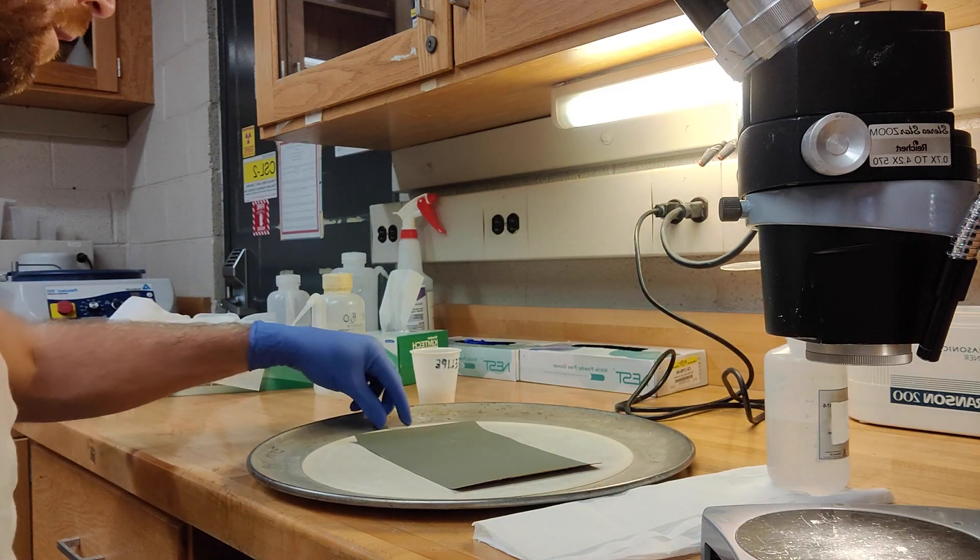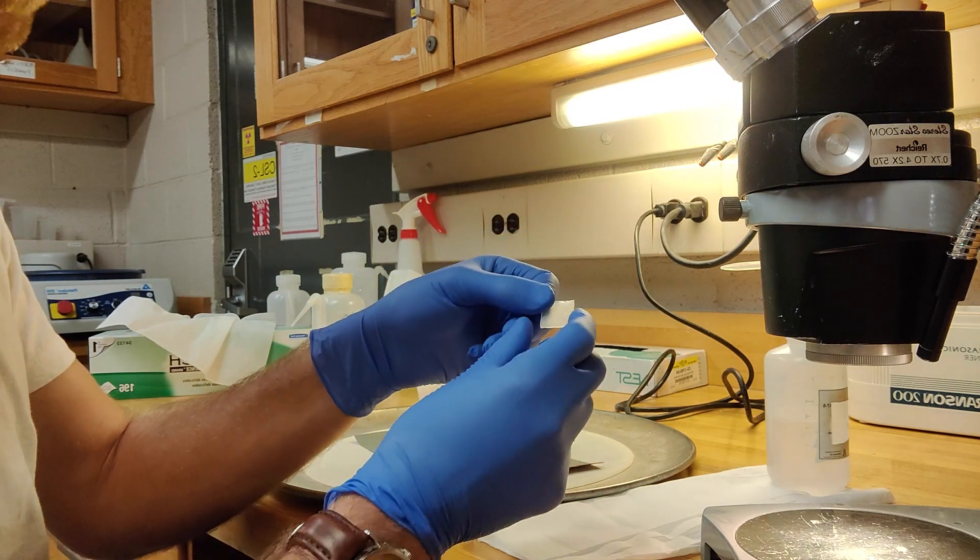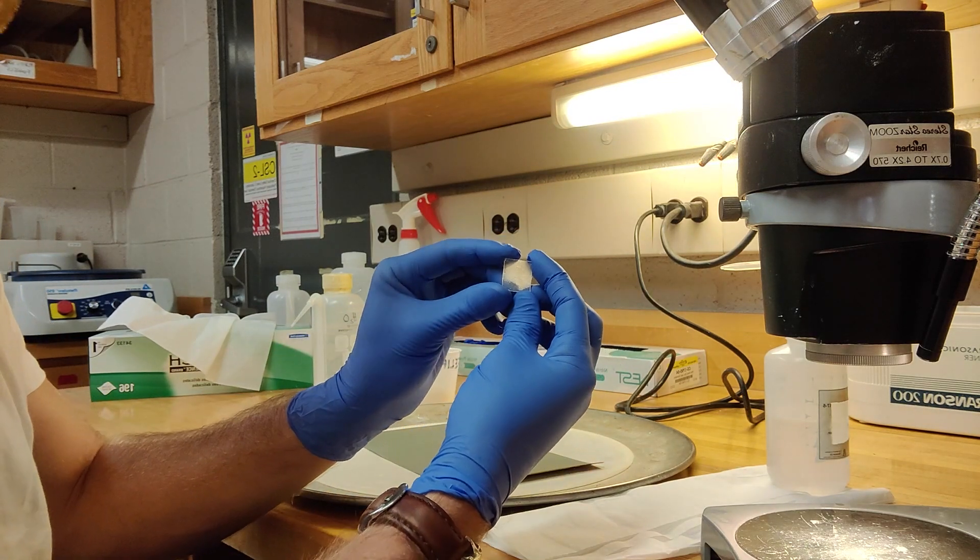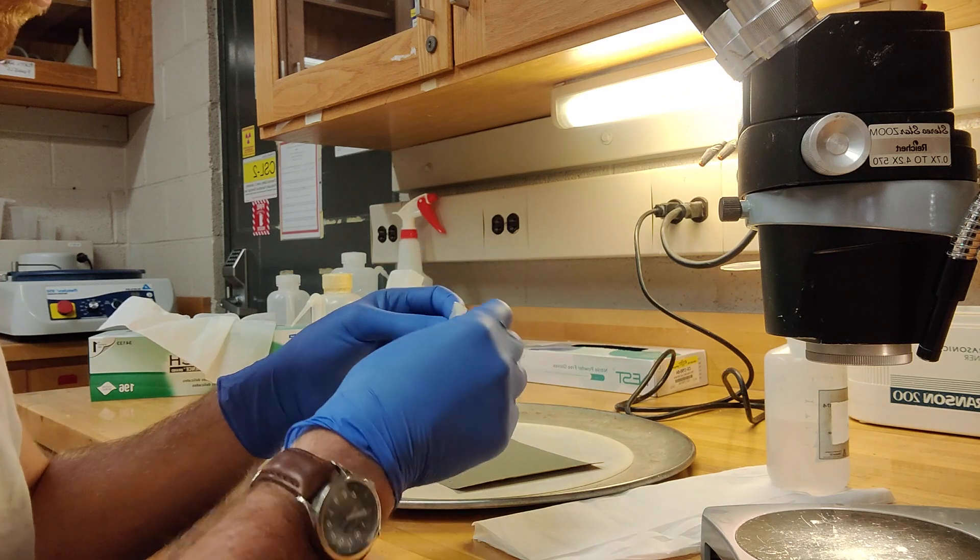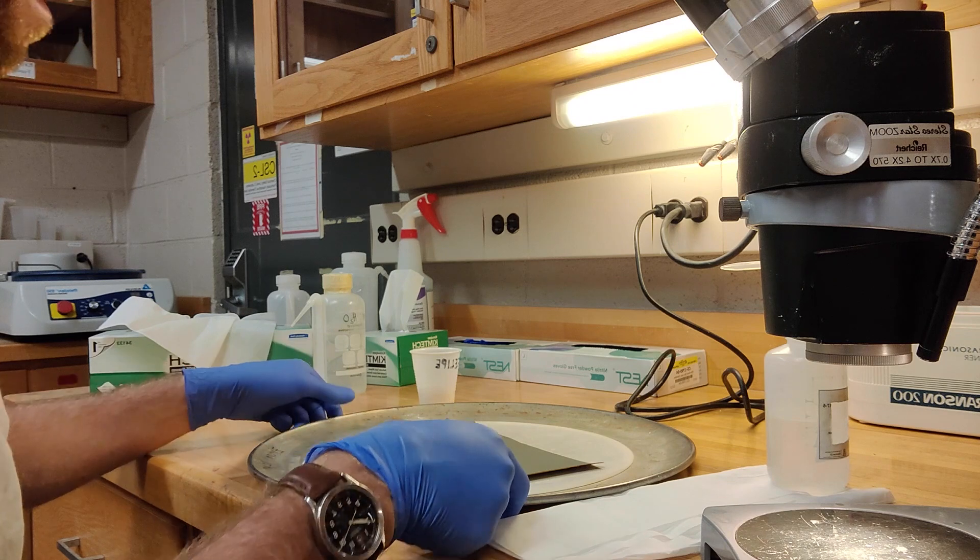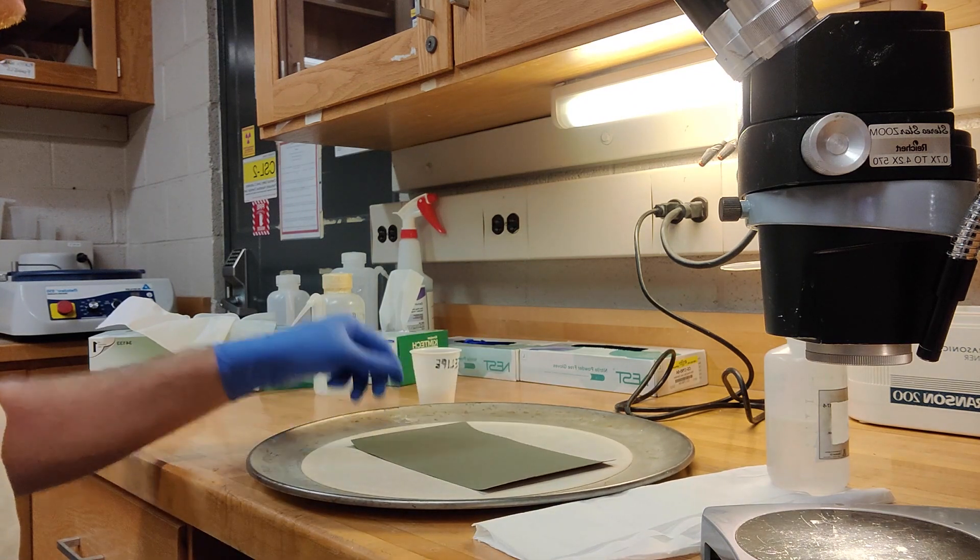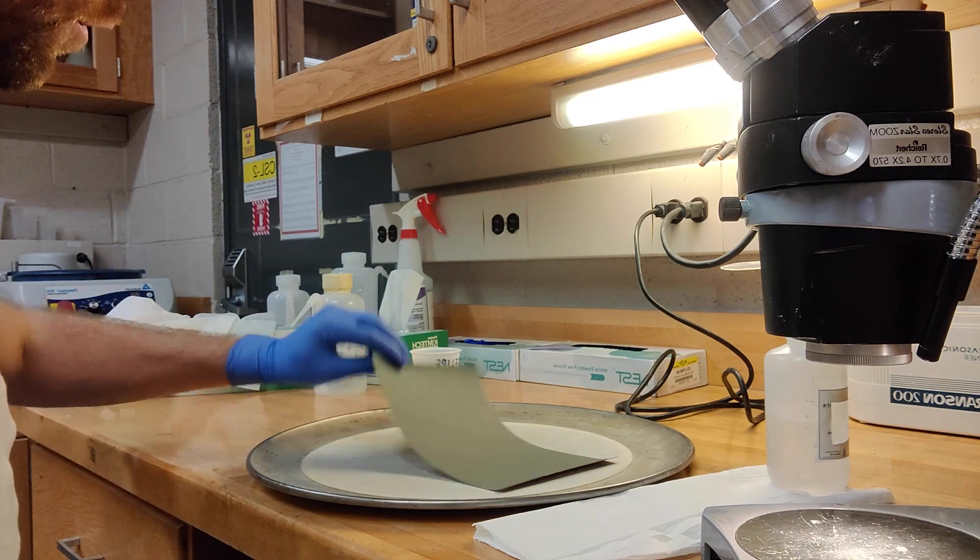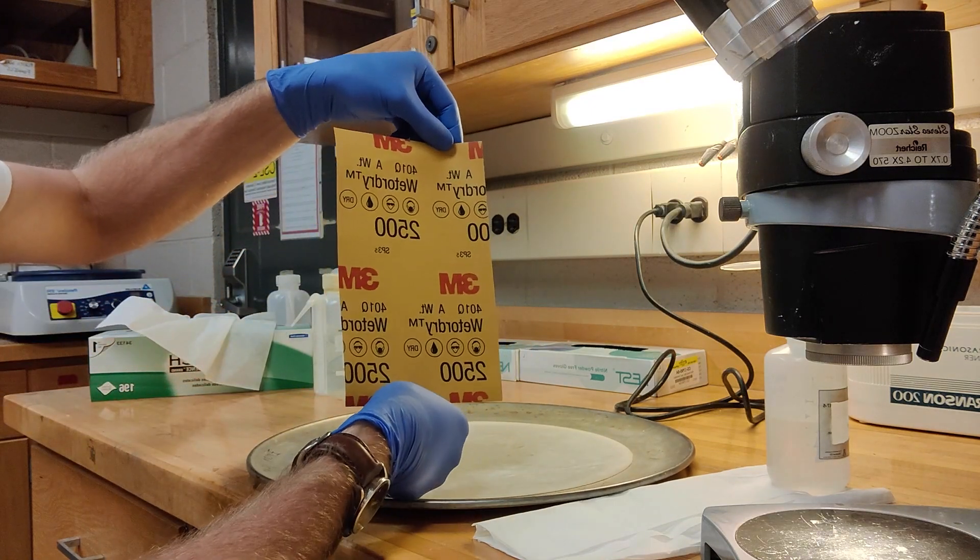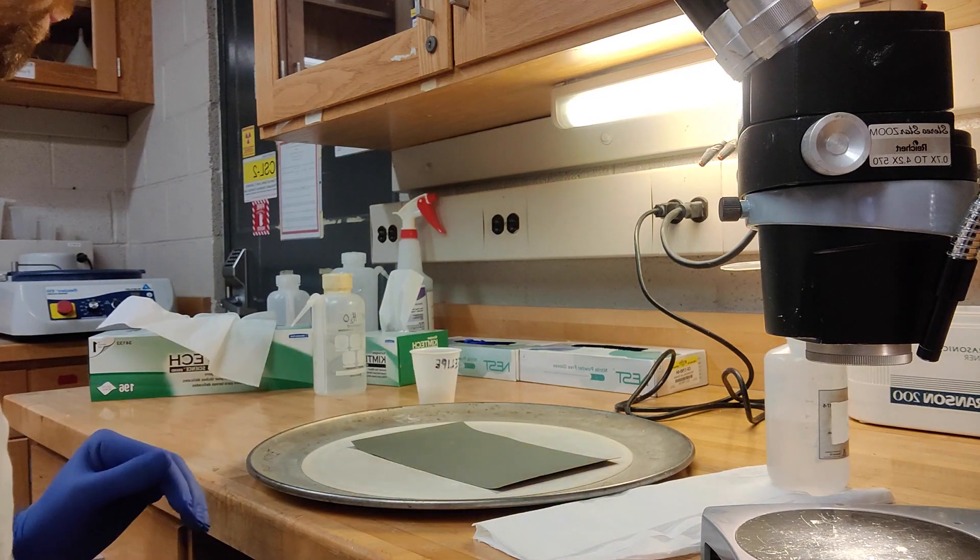Once we have done with our samples, we've mounted them in epoxy, and they're nicely labeled at the back, we can begin the polishing process. The first thing we do to polish them is we grind them down using grit paper at 2500 grit, and we grind it down to expose the internal section of the apatite.